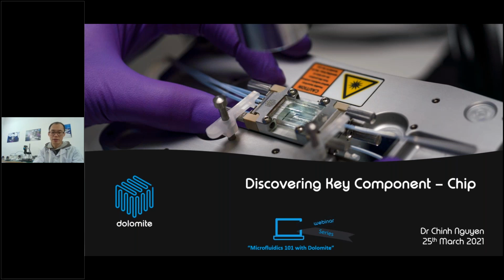Today's webinar is one of a series of webinars we call Microfluidics 101 with Dolomite. This webinar is delivered every last Thursday of each month throughout 2021. Today the topic is discovering the key components of the chip. We will learn everything about the chip: how to fabricate the chip, and how to choose the right chip for the application.